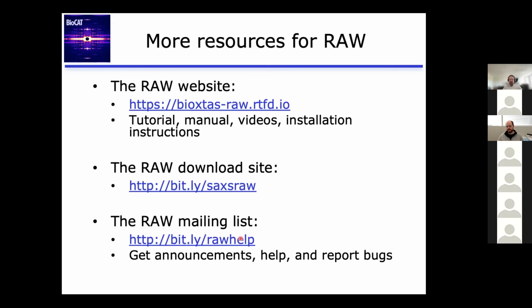We do have a couple of questions. First one from Kumar Ashikar, and I apologize if I'm mispronouncing your name. Is it better to average the image files or sum them? And does RAW have a feature to sum images?